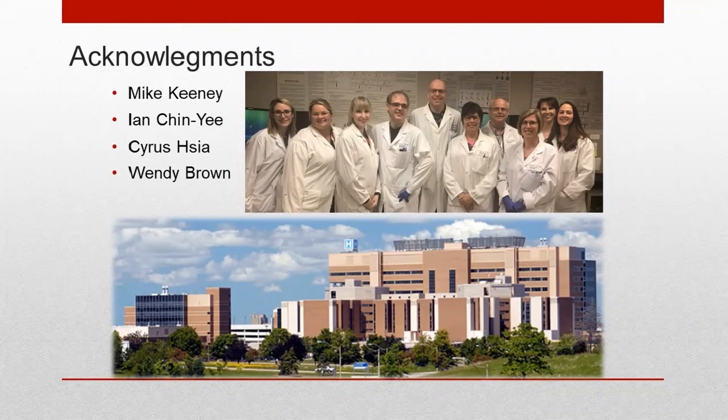But the percentages, the package insert, all of those things that come with the control cells are developed for the ClearLab 10 color, not for any other product. It's not a product that you can just use for running your own LDT. There's no reason why you probably couldn't evaluate it, but again, it would be breaking the IVD, or it wouldn't be IVD approved.